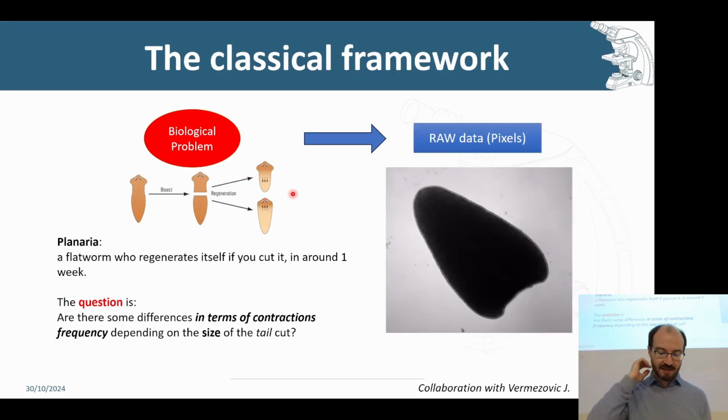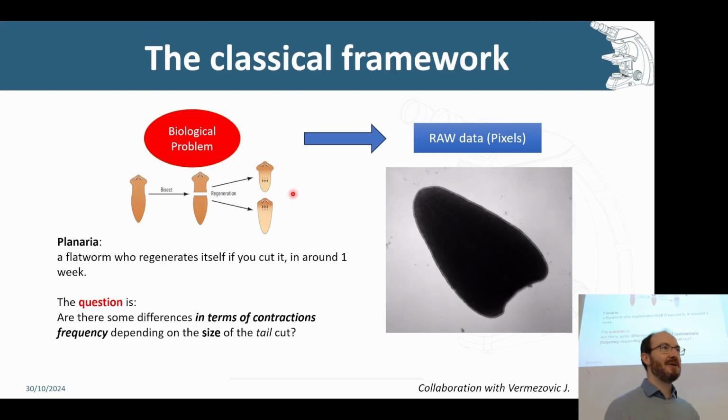And so if you image it, you see that it was pretty brief there, but you see that it stays a little bit stable and then it pulses. And you want to know, does this pulsating thing or this contraction frequency, is it dependent on the size? Can I actually now quantify, okay, if you were to cut it longer, is it going to pulse quicker or slower?